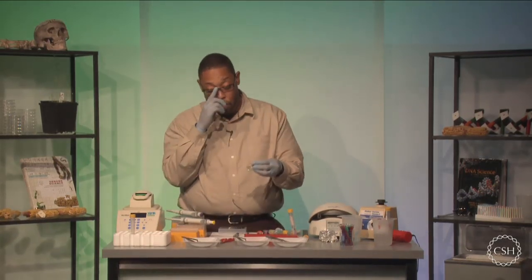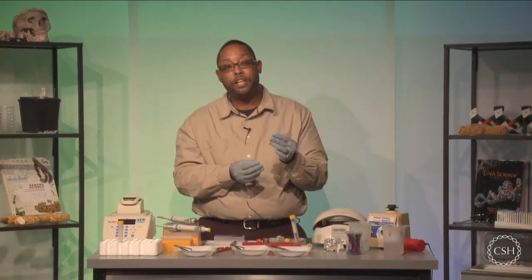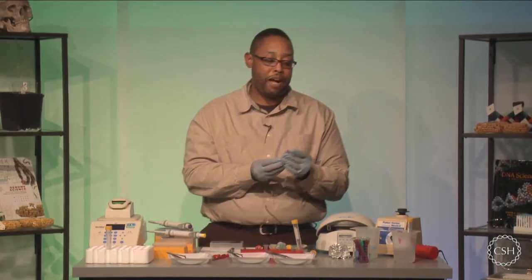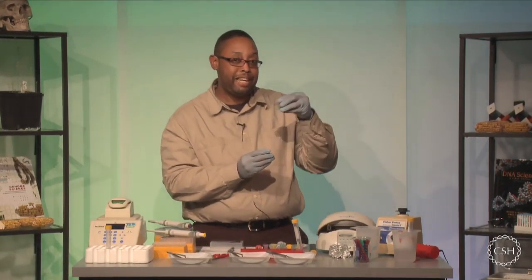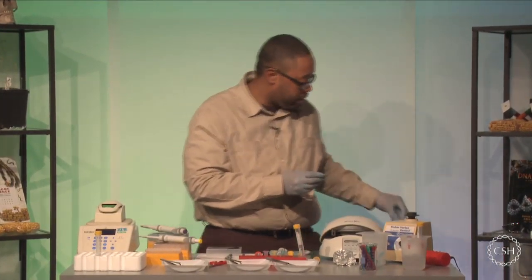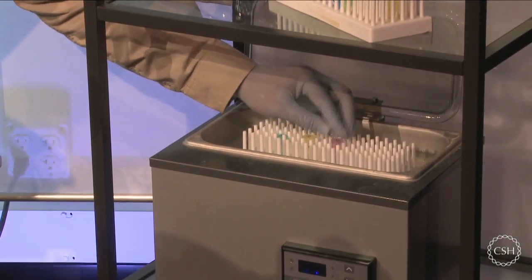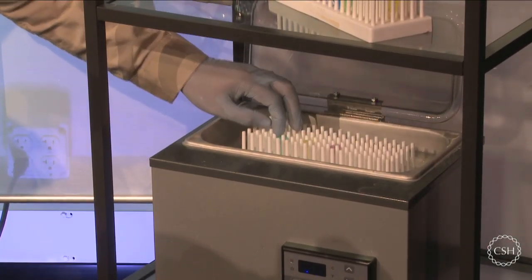Now, after you have all of your sample test tubes mixed, you're going to then want to incubate them briefly at about 57 degrees Celsius for about 5 to 10 minutes. So now I'm going to take these samples and shift them over. So let's take them over, and place them into the incubator.